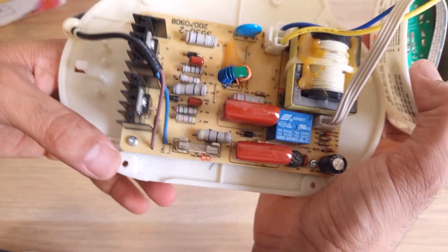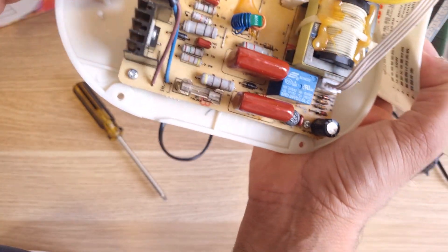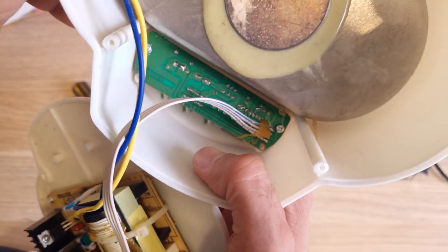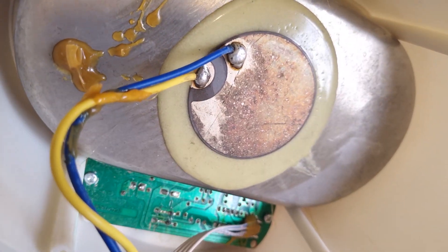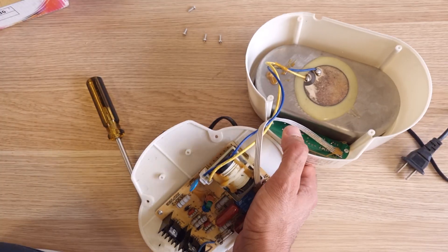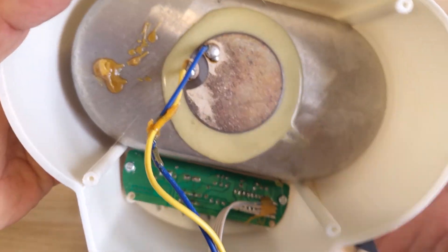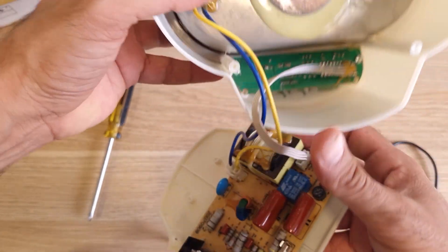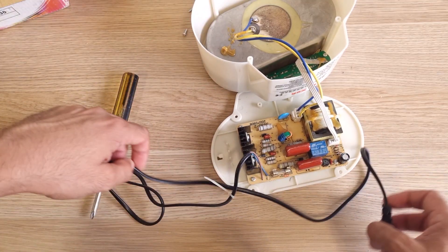This is the power supply — looks okay. And this is the ultrasonic element. This is the main element — looks like just a piezoelectric disc. Anyway, that's everything. Let's turn it on and see.